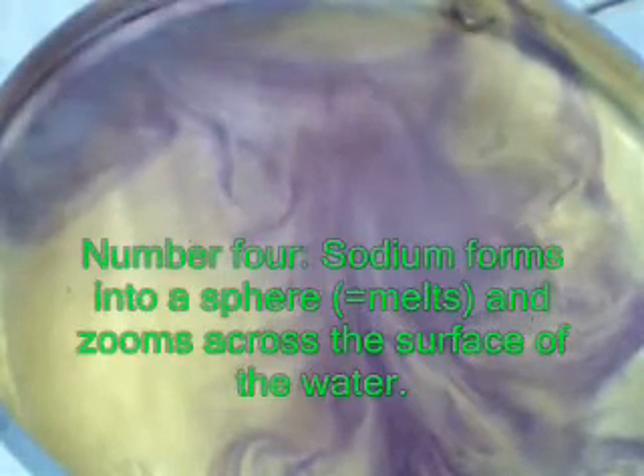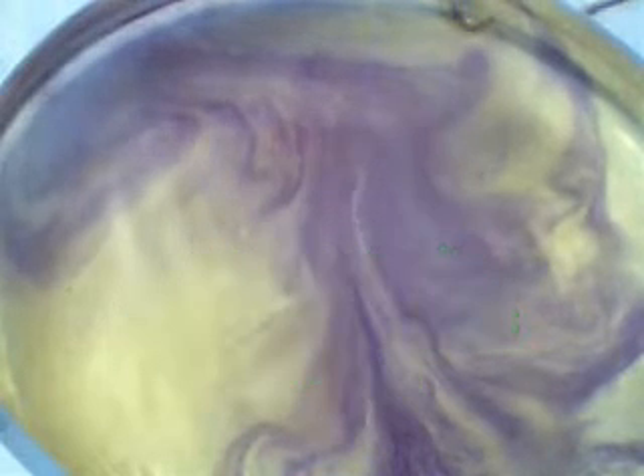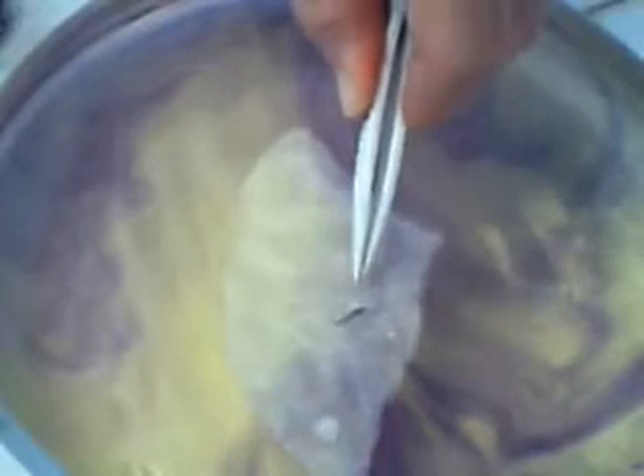Have you noticed a trend already? I'm going down Group 1 from lithium to sodium. Now the next metal to do is obviously potassium. I'm going to put a bit of filter paper down again — it also prevents the sodium from going on the side. This is quite an elongated piece of sodium I've got on there. Can you see? It's quite long, but it doesn't matter.